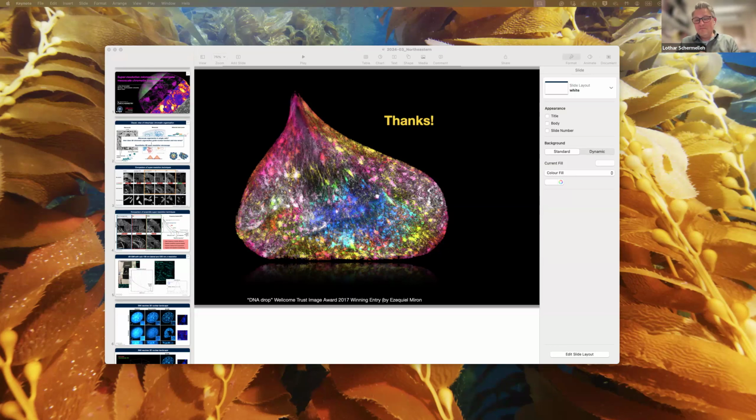But we just repeated this experiment, and that's what we saw essentially. And we also, of course, looked at the presence of cohesin, because it was tagged with a green fluorescent protein. So we made sure all the cohesin in the cells that we looked at was really degraded.